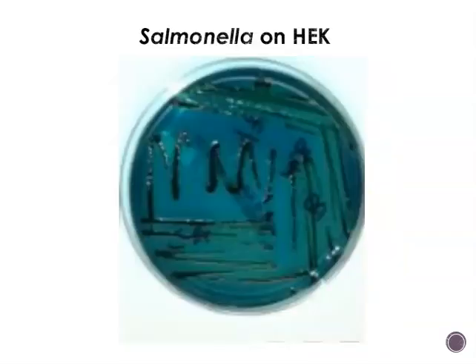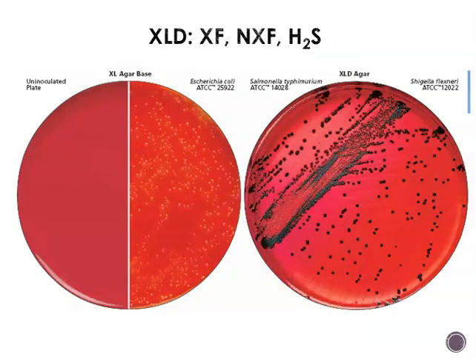And then here's just another picture of Hektoen with only Salmonella growing on the plate. So you can see the media has not turned orange, so there is not a lactose fermenter on there. And we've got those green colonies, and you can see some black there also.